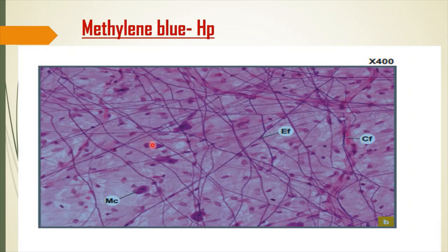And then these cells here, this cell here, this cell here, this cell here, have dark stains in them. These are macrophages that have phagocytosed material inside of them. And these other cells are the fibroblasts. So for the high power representation drawing, use this diagram to draw because it is very clear.